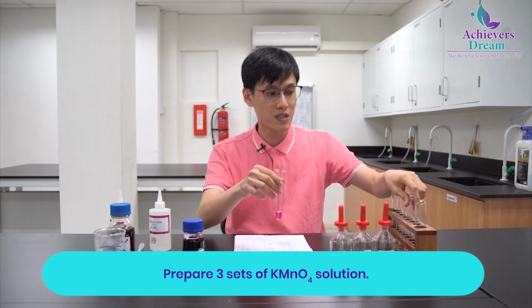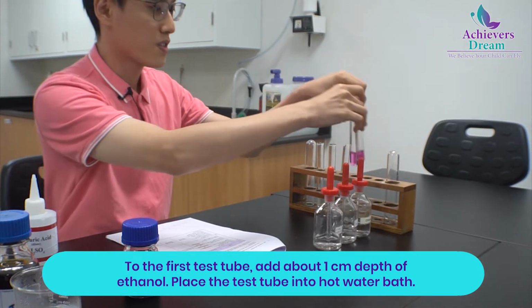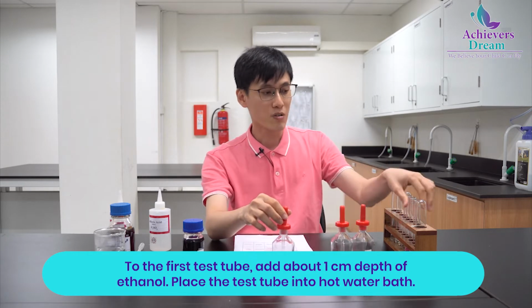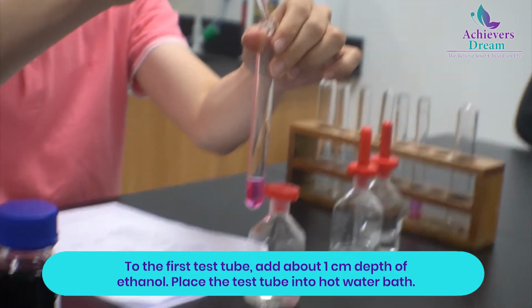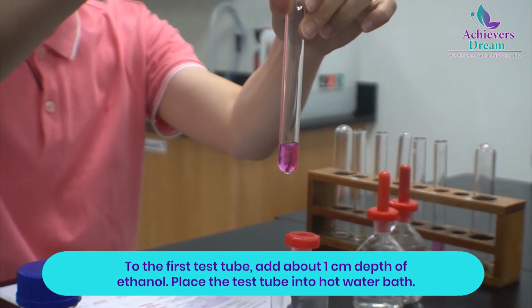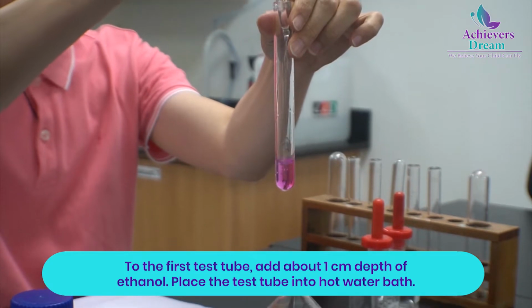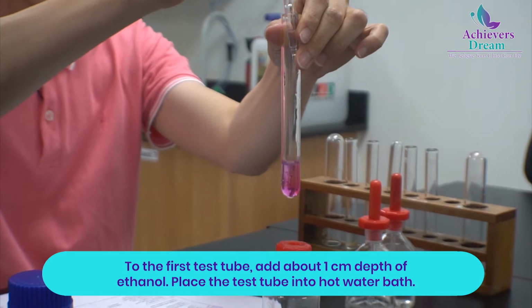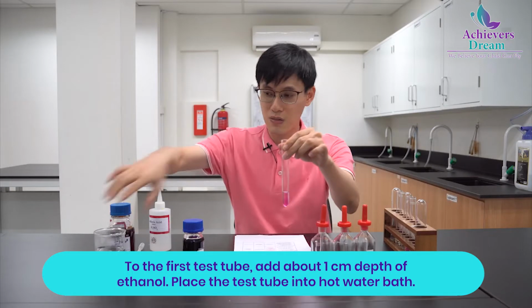So I have 3 test tubes of KMnO4 solution, which will be adding 1 drop of 3 alcohols to each of them. The first alcohol is ethanol. Ethanol is a primary alcohol, so we expect to see decolorization of the KMnO4. So I'll add about 1 cm depth of ethanol in, and we are going to place it in the water bath right here.